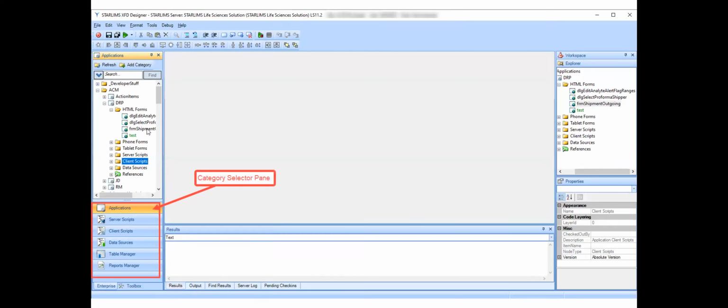And then there's all sorts of minutia data that is related to the sample workflow for dynamic data storage, the results tables, any of the analytes that are associated with those tests that are defined for the system. All of those tables are managed within the table manager.